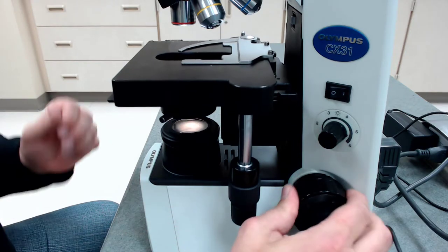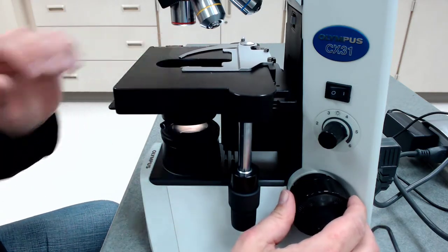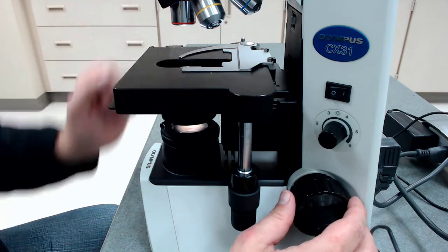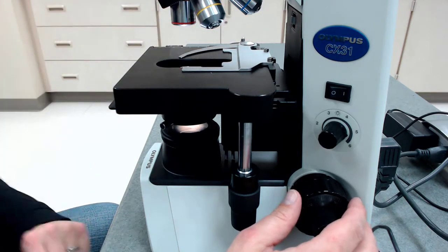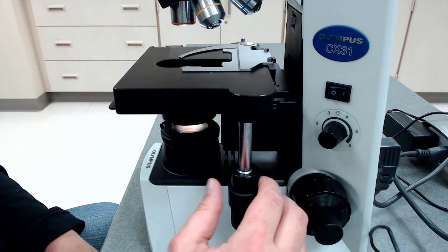So here we have the stage. This black portion here is the stage. And your slide will go right there. It's held in place. So you actually want to put the slide all the way in.